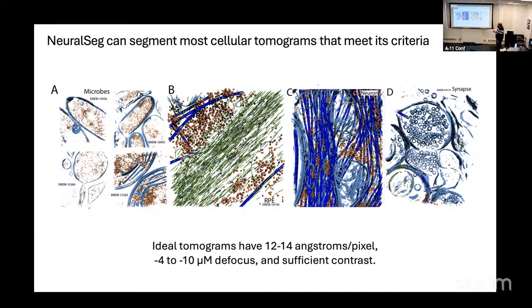But so these are microbes. These are actually different types of bacteria where it's finding ribosomes in the double membrane. This is an archaeal cell where it actually has some archaeal actin filaments in it. You can't really see them, but they're in there and it's getting picked up by the network. This is a blue-green algae, retinal pigmented epithelial cell, intact neuron, and then this is actually brain tissue, sort of milled recently out of the Goal lab.